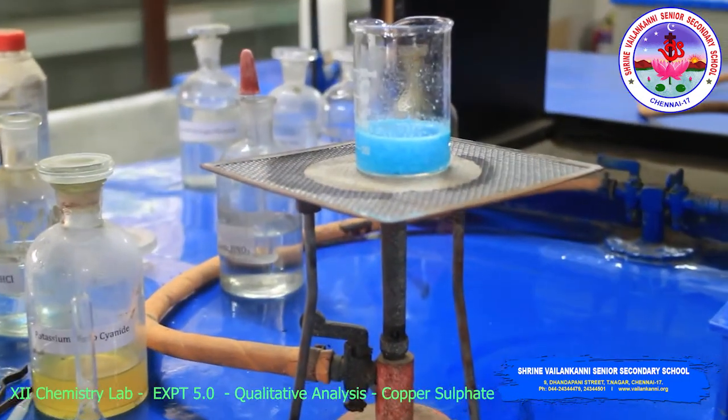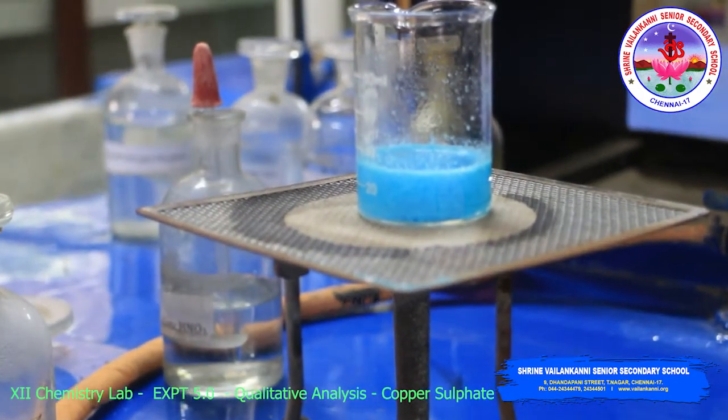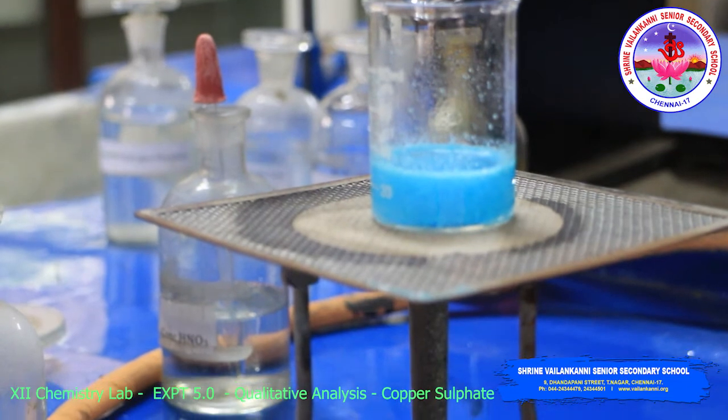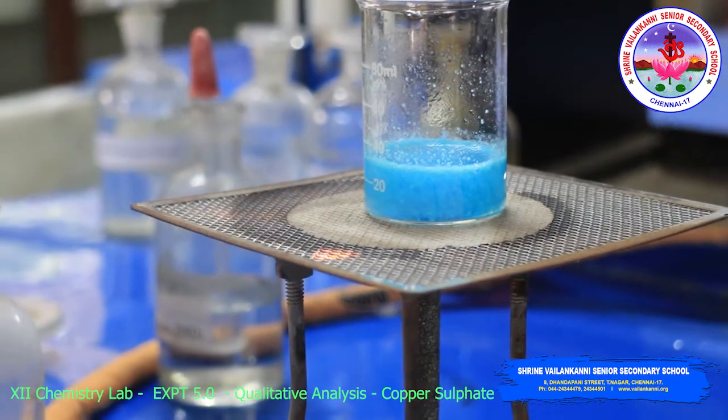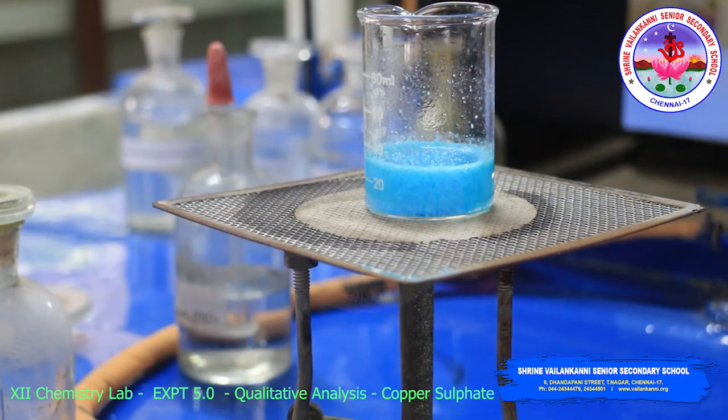Now preparing the sodium carbonate extract: take the substance, add twice the amount of sodium carbonate, add water, then heat, then cool. After filtration, the extract is ready.